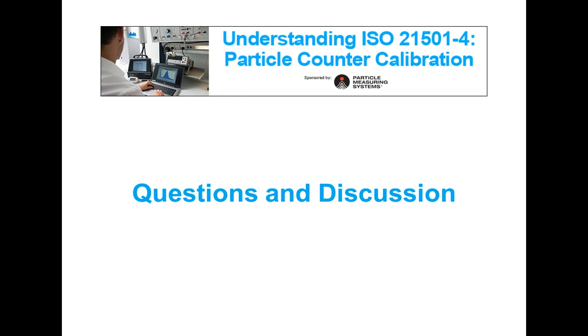Yes, particle counter calibration is a must. You should think about the importance of the data you're going to obtain from a particle counter. Most of the time, you use this data to release batches of product and so on. Plus, we need to mention that the actual standards, ISO 14644 and ISO 21501, require you to calibrate your particle counter at least once per year. So not doing that will result in non-conformity with authorities, and of course, not a nice situation with authorities.